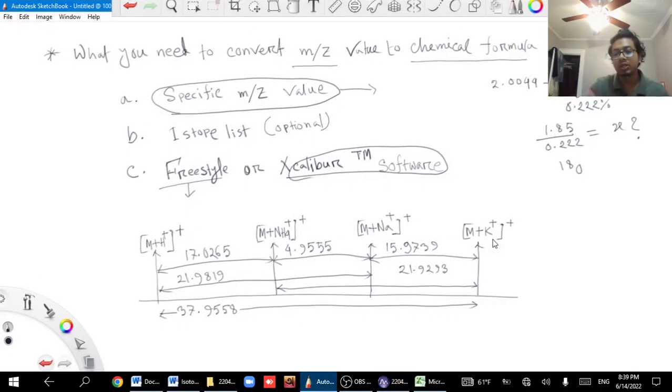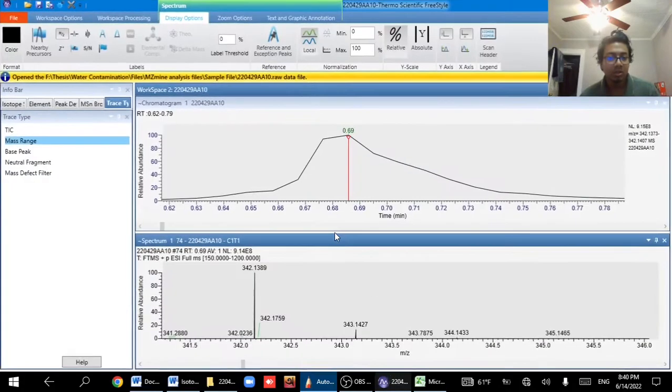You will generally find that an organic compound has carbon, oxygen, nitrogen, sulfur, phosphorus, and hydrogen, of course hydrogen. So we found carbon and oxygen, but to find nitrogen, the next one, I need to show the difference of that isotope.